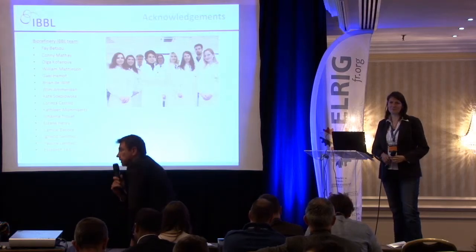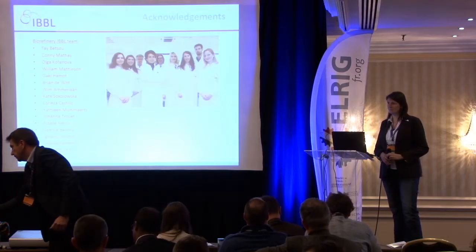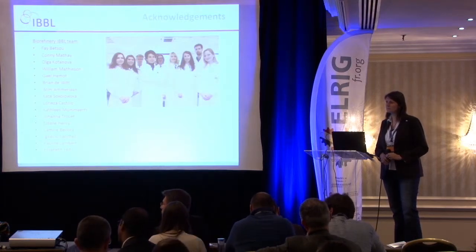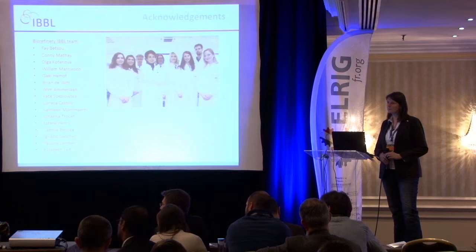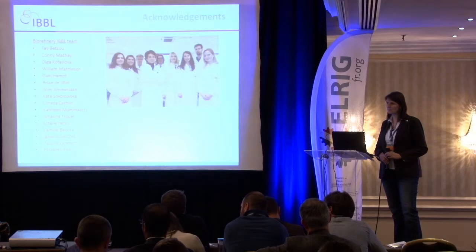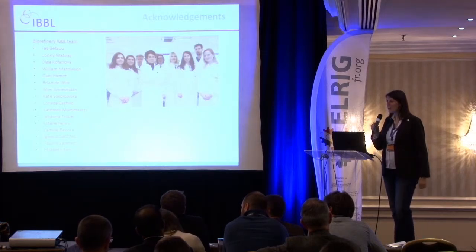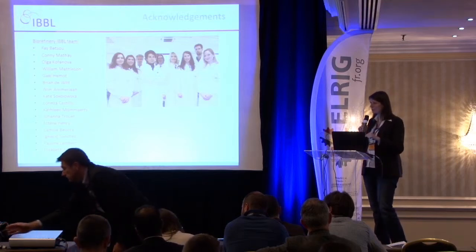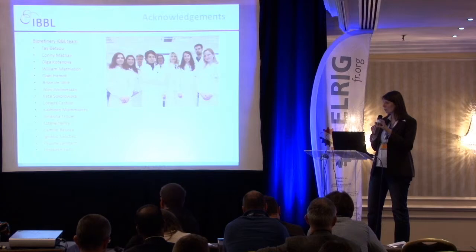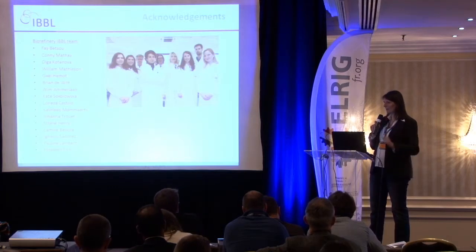Just a question about the visual inspection to determine the buffy coat zone. Do you also estimate the quantity to be pipetted by the Tecan, or how does the Tecan stop to pipette? It will always pipette 940 microliters exactly, so approximately 1 tip of 1 ml.